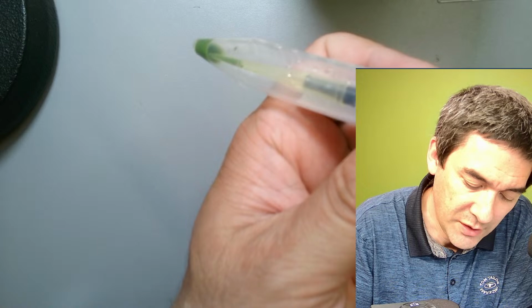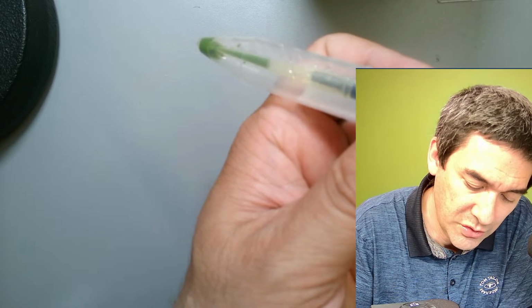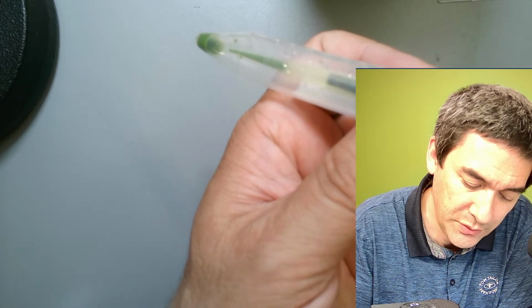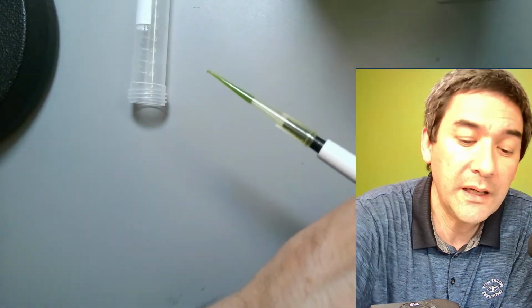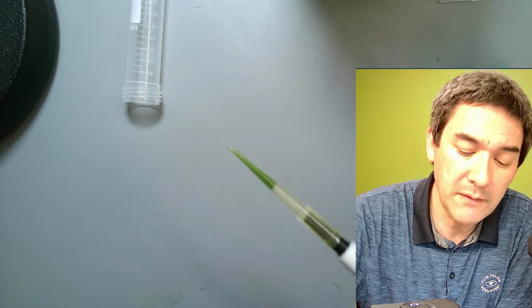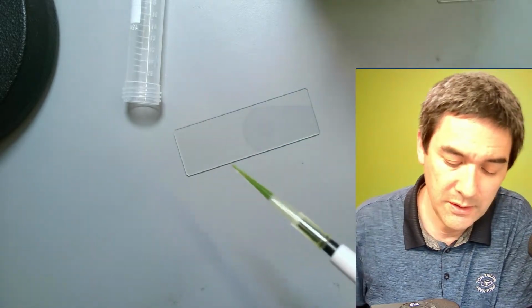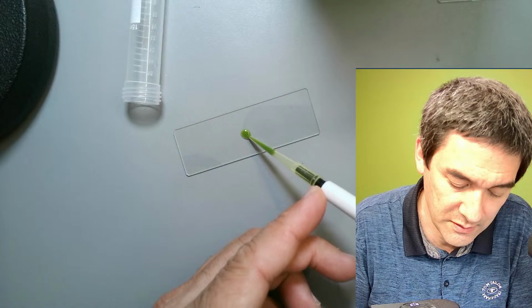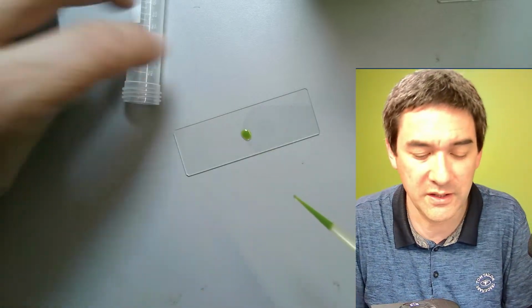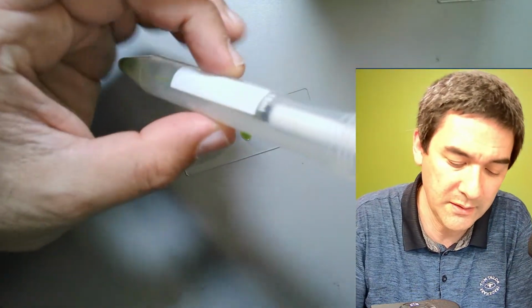And this allows me, if it's very concentrated, to use a fairly small amount. It's way more than I need. I can basically make a very thin layer and still get enough cells. So I'm going to make it deliberately very small. I'm going to put the rest back.